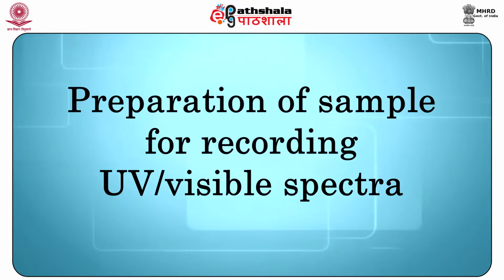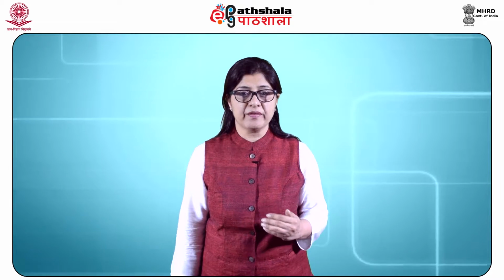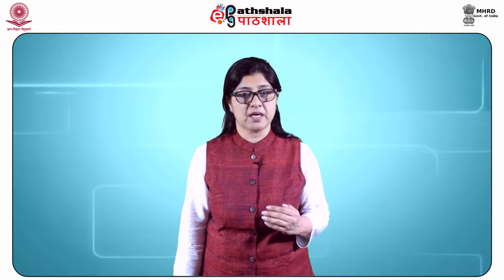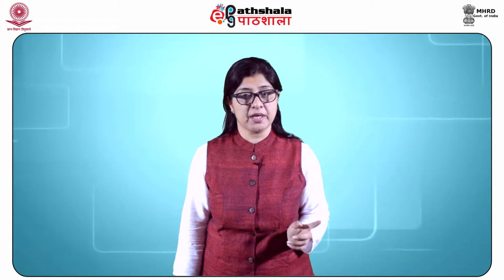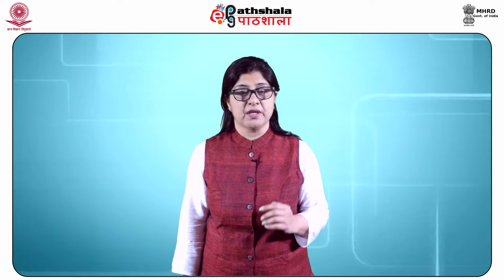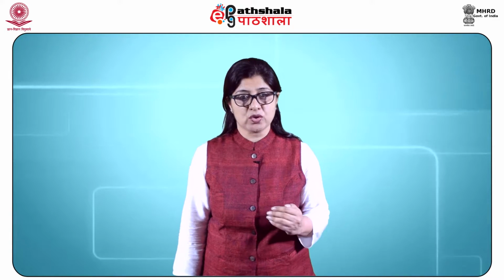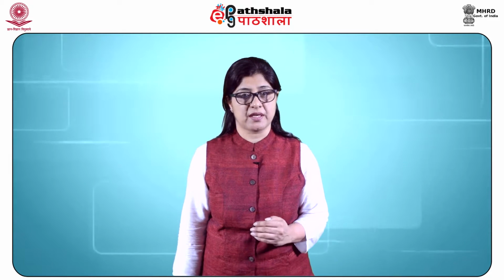Preparation of a sample for recording a UV visible spectrum. For recording a UV visible spectrum, the compound, whether solid or liquid, is dissolved in some suitable solvent which itself does not absorb the radiations in the region of wavelength under study. The choice of solvent depends upon the solubility of a given compound in that solvent, the nature of the compound, and also the region of wavelength under study.